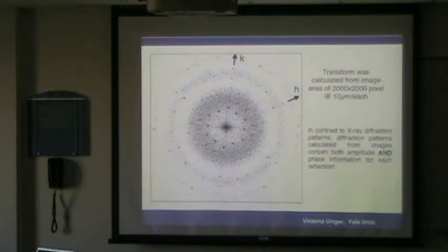A 2D crystal is more like a floor of tiles, for instance, where you just have one layer of regular arrays, but not along the z-axis. How are you going to get 3D information then? I'm going to tell you, just a sec. The 3D has nothing to do with the 3D of a crystal packing, basically. The 3D has to do with how the molecule looks.